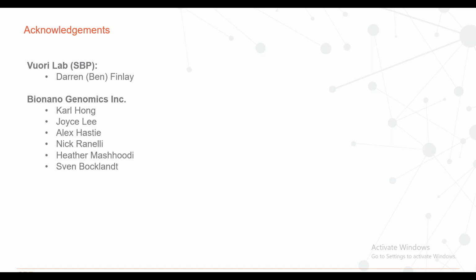One more question. Apart from the data from the Hoyschen paper, are there any other data comparing Bionano data with standard sequencing techniques? So there's a number of papers from consortia, including the Human Genome SV Consortium, that compared our sensitivities for structural variants against PacBio and Illumina mostly. I have some slides on that, but I don't think I have them handy right here. We can send it to you later. But what they found in that paper is that really insertions in general are extremely hard to detect with sequencing technologies, even with PacBio. And so we really cornered that. Everything above 1 kb that's an insertion is almost exclusively detected by Bionano.